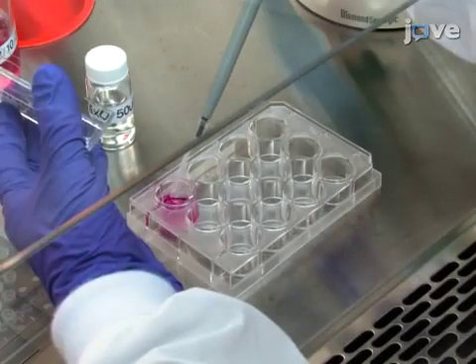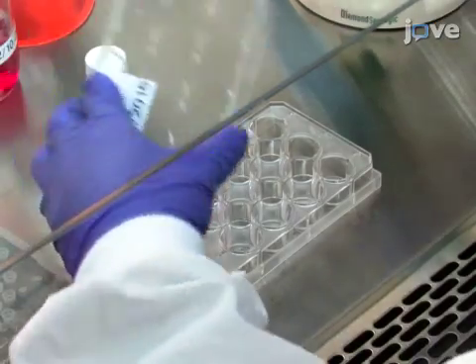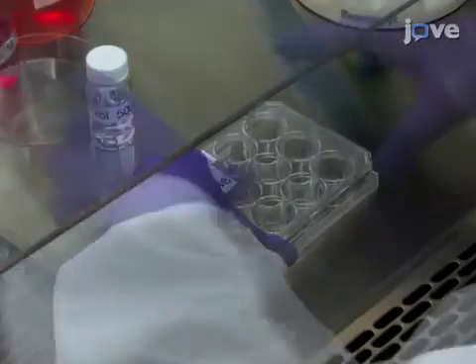To perform drug treatment of the cultured cells, add a drug compound solution into the 12-well cell culture plate.